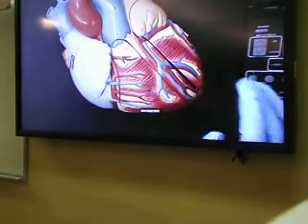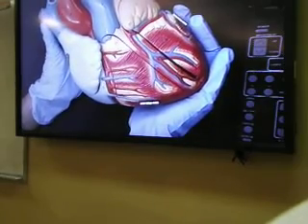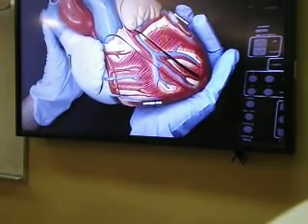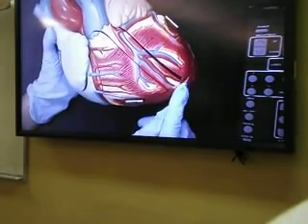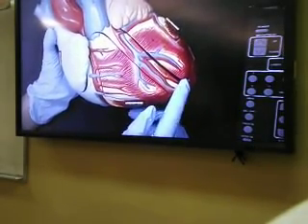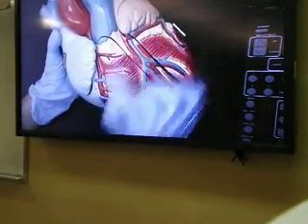Alright. So once we understand that, let's find the inferior region of the heart and the superior region of the heart. The inferior region is more rounded, which we call the apex. The superior is a little bit broader, which we call the base.